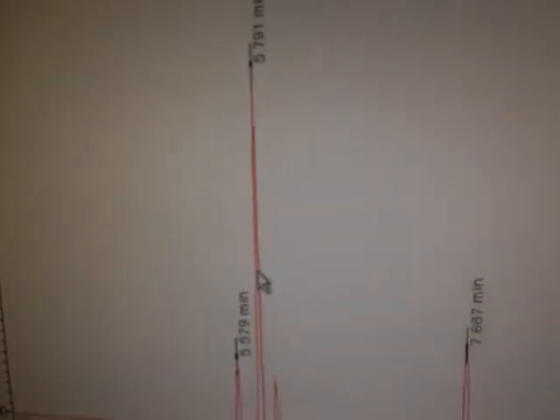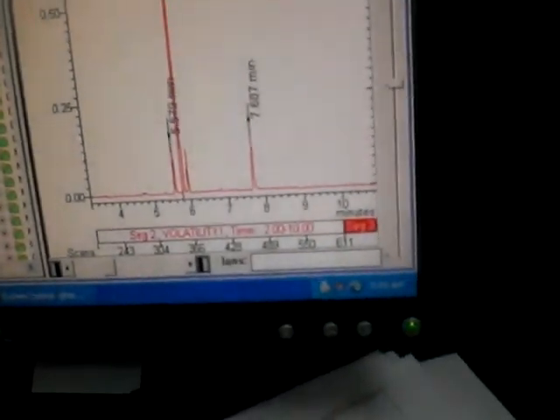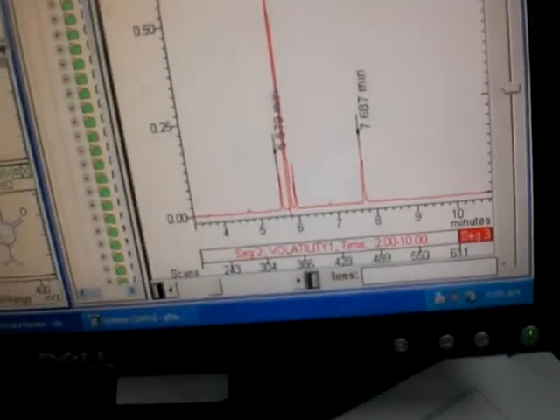Now let's make sure that this is thujone from the library of the mass spectrometer. We will click on it and see, yes, we have the structure here. This is the structure of thujone, and this is the name of thujone. Now we will check the peak of carvone, because sometimes we have many peaks and we don't know if this peak or this peak or this peak is for carvone. This will help us by mass. This is the structure of carvone, and we have the name here, carvone.